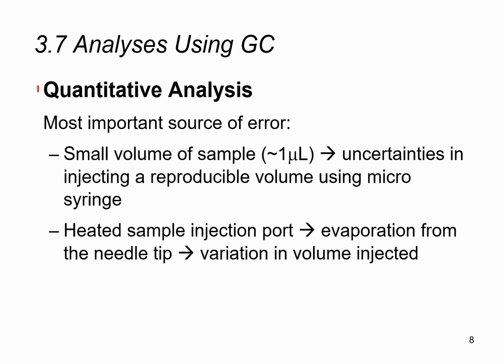So when we do a gas chromatography quantitative analysis, we typically will take a small volume of sample, typically 1 microliter, and inject it into the instrument using a small syringe. So of course, when we do this injection, it is not physically possible to inject the identical amount, 1 microliter, each and every time, right? Sometimes I will inject a little bit more, and sometimes I will inject a little bit less.